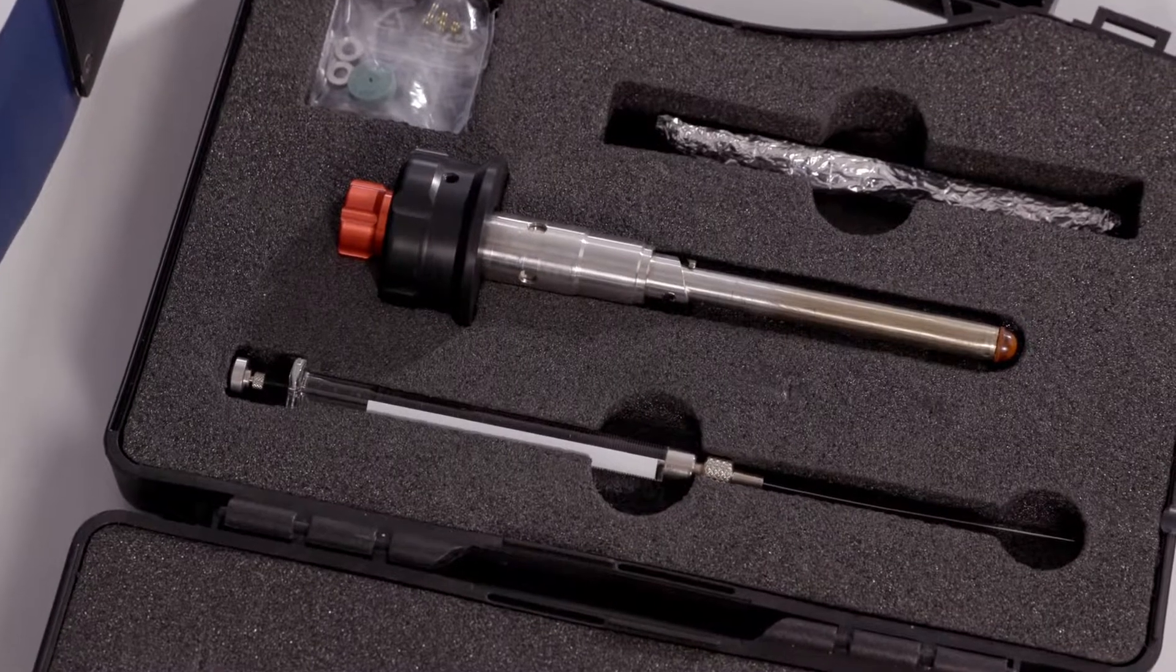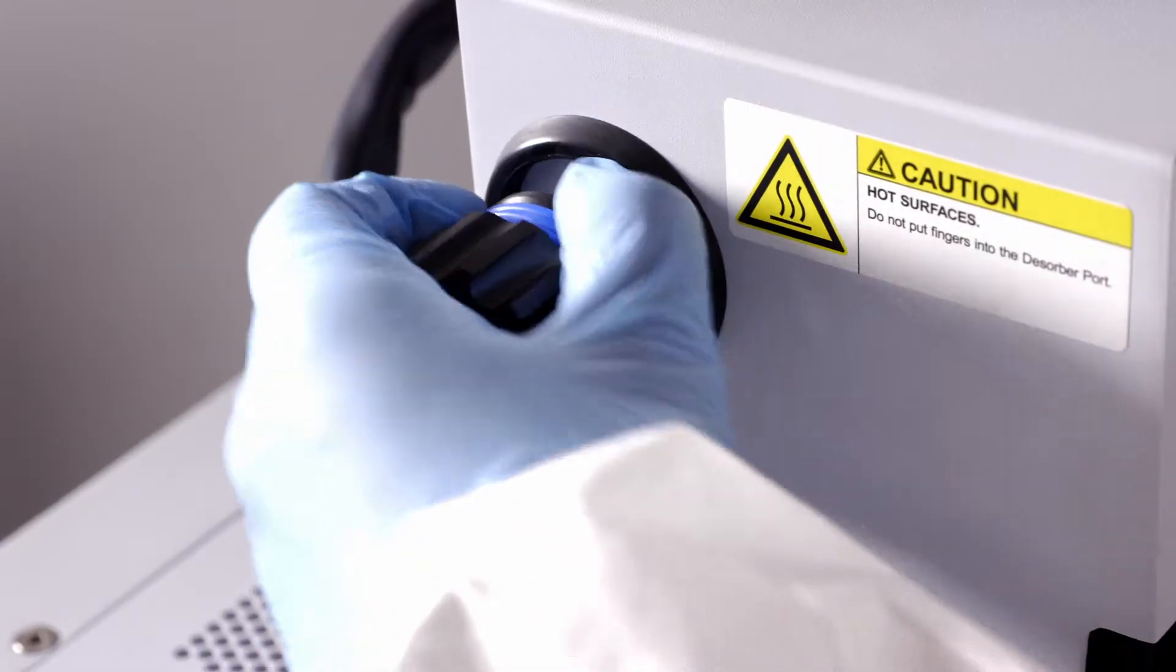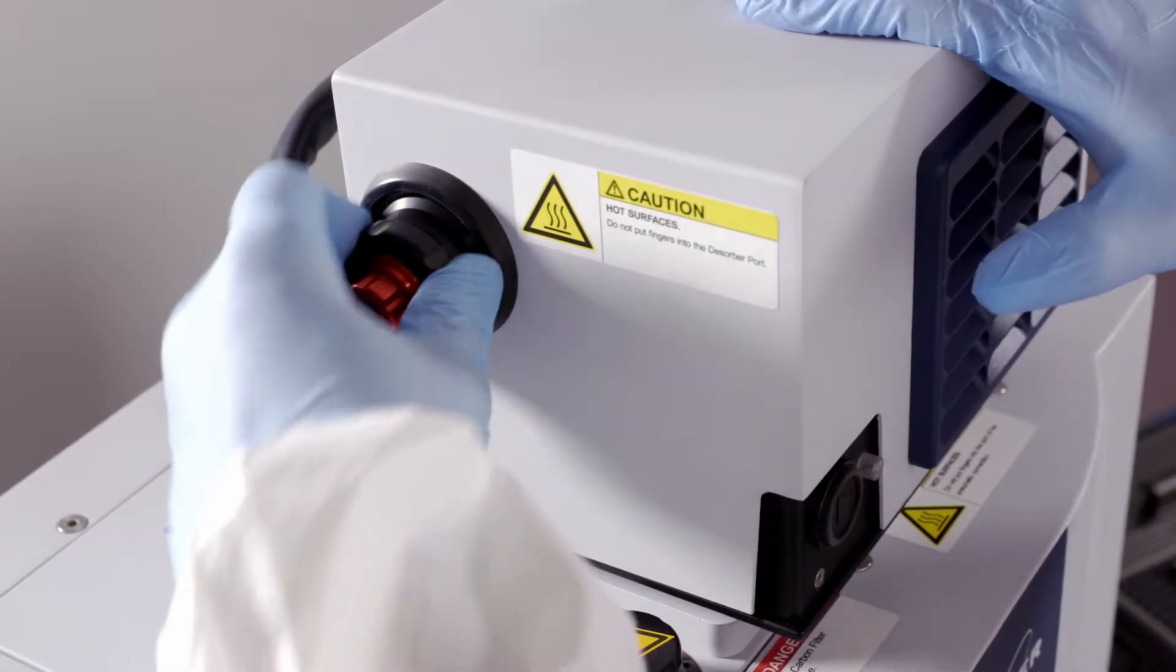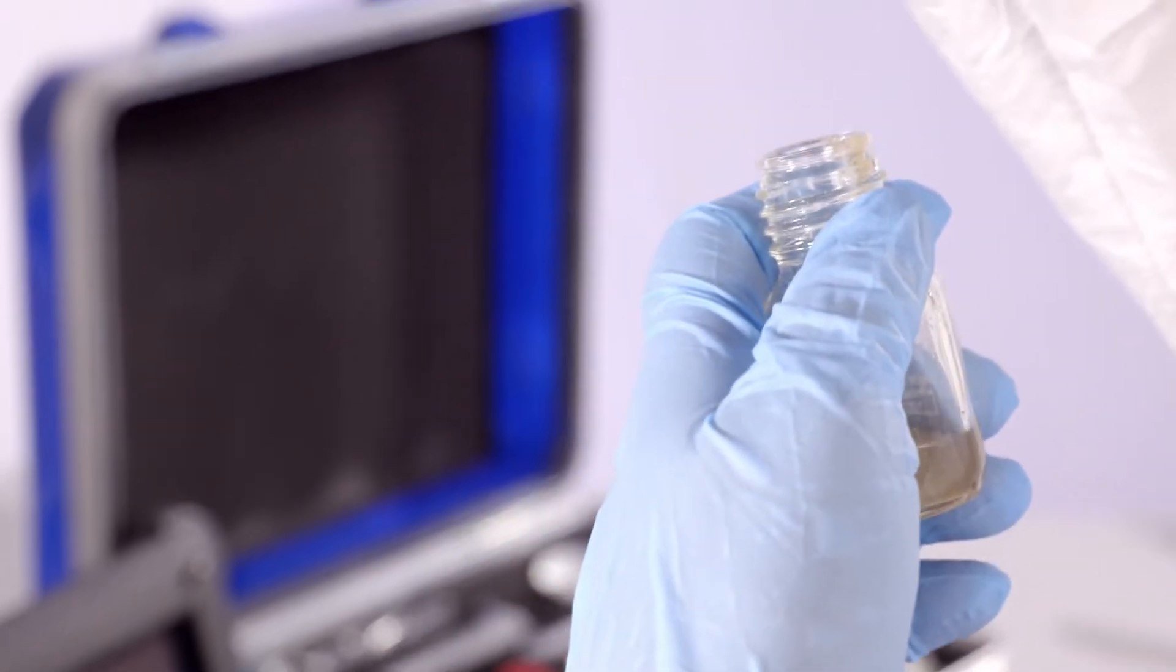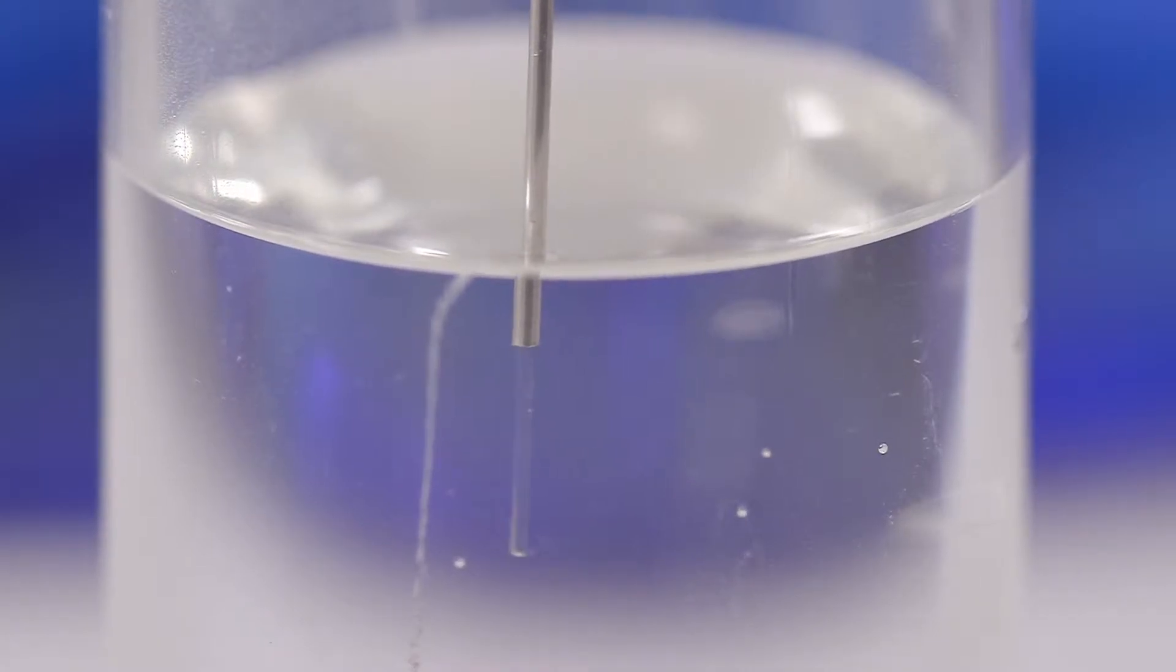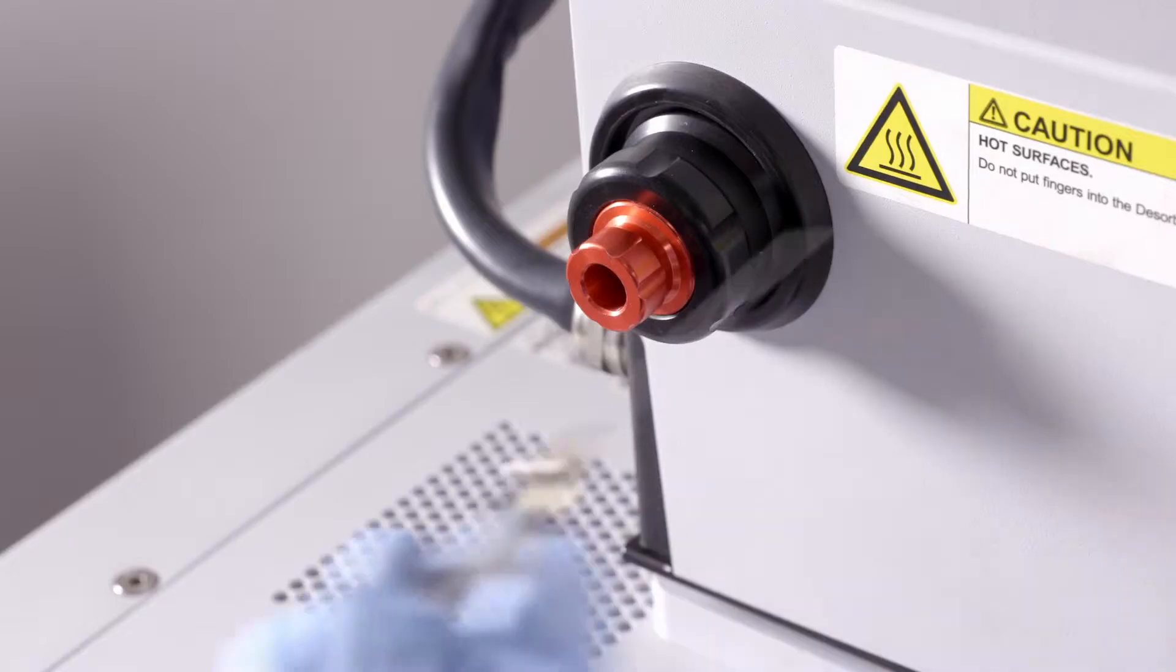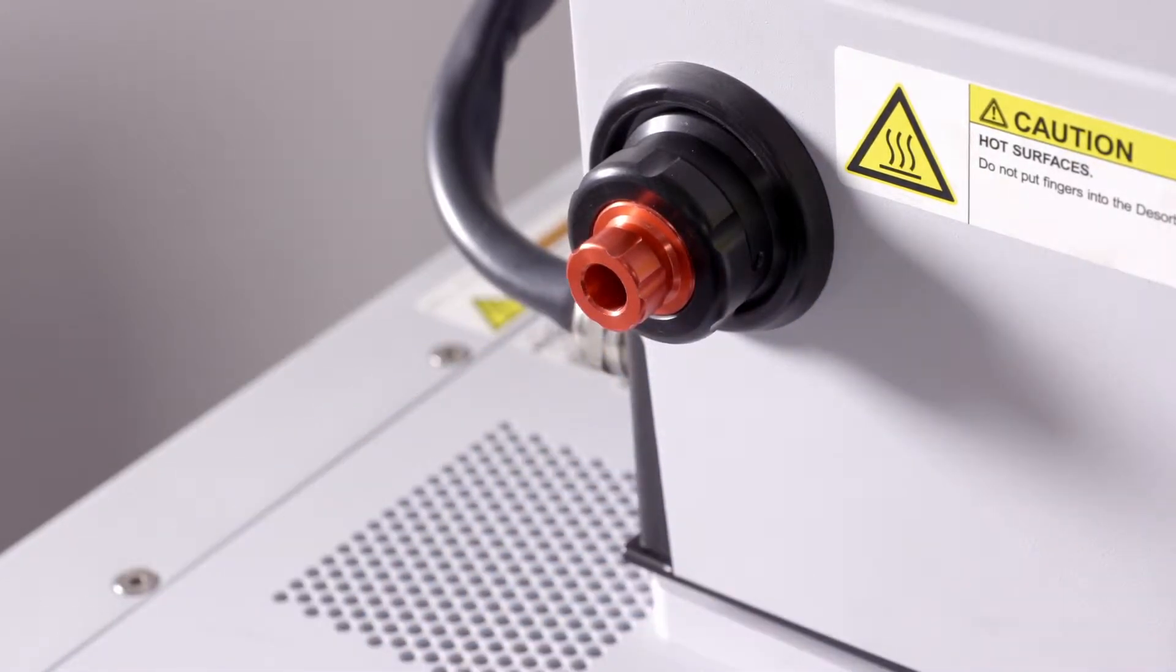The SPME desorber kit is used for measurements where gaseous or liquid compounds have been absorbed onto SPME fiber. For semi-volatile organic compounds, the thermal desorber system can be substituted rapidly with the injection kit, allowing liquid samples to be introduced using a conventional microliter syringe or the special solid-phase microextraction desorber kit.